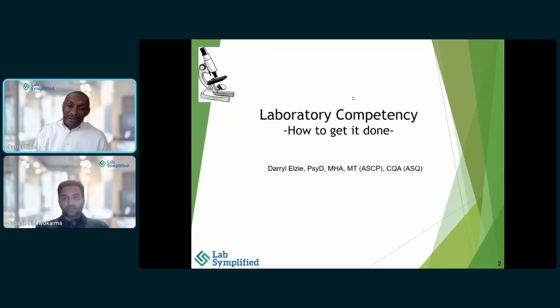And we wanted to do this seminar here at the beginning of the year because you should start competency now. To be successful in competency, you must have it organized. So to get the organization, you need to start at the beginning of the year, because we're going to talk about some of the caveats as we move along. We're going to talk about the semi-annual, or what we know as the 6 months competency. To get a handle on that, you should start at the beginning of the year and plan out how you're going to get it done. I usually suggest people set the end of November as the date to have everybody's competency completed, because of course when December comes, you have a lot of people out for different reasons.